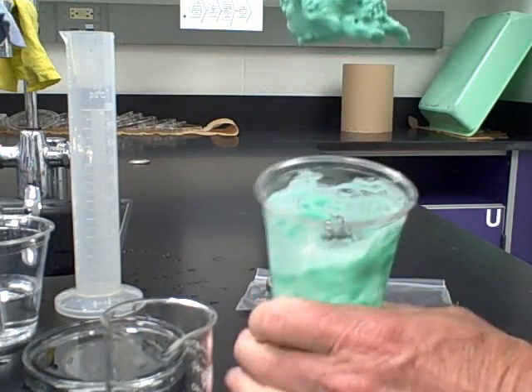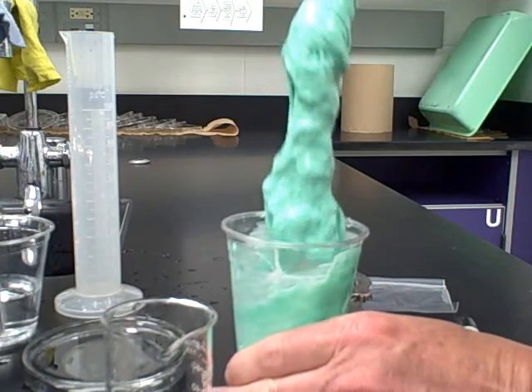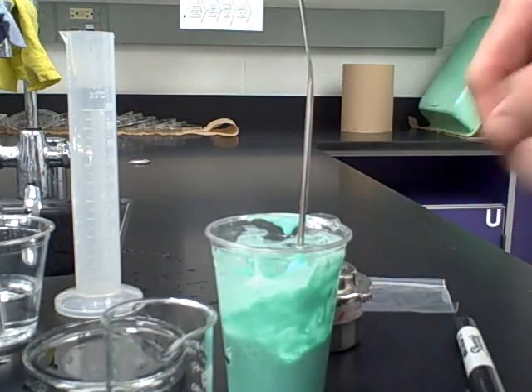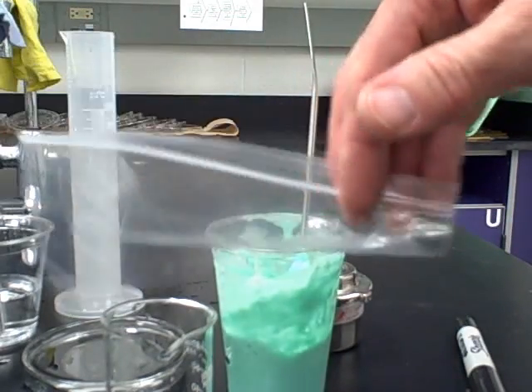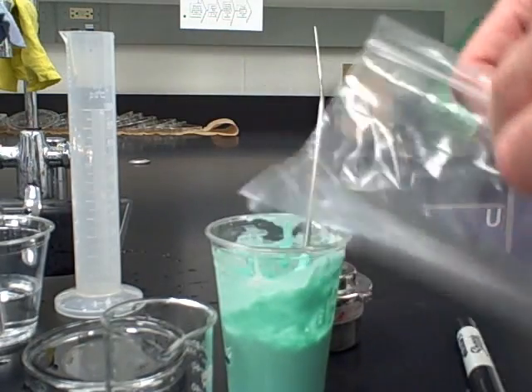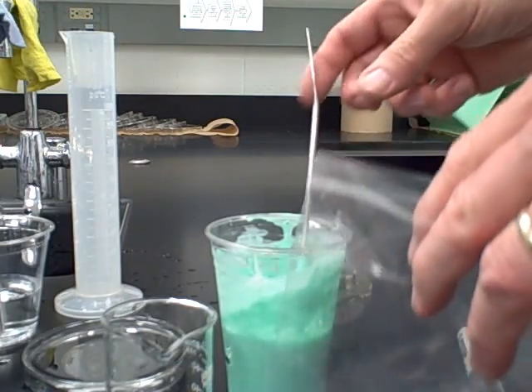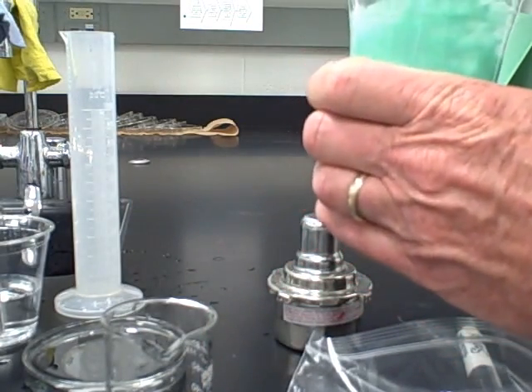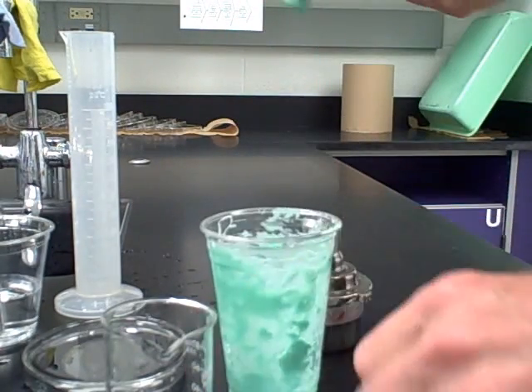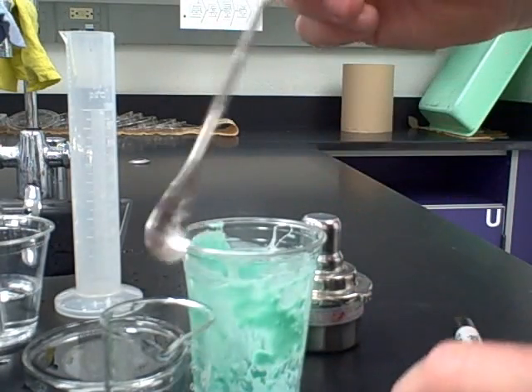We've mixed things for a while and now we have a blob of amorphous solid. Since it's made of glue and borax it should be fairly non-toxic — though I would not recommend eating it. Get that into a zip lock bag so it can rest overnight. During the resting stage, the borax cross-linkers will link to the polymers of the glue and create a very nice amorphous solid. Get as much out of the beaker as you can, sliding it off the micro spatula into the bag.